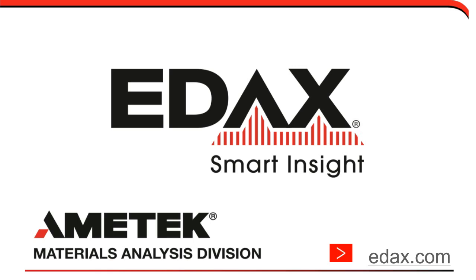Yes, next question is, does the TEAM software work like the EDAX Apex that you're describing? And yes, much of the algorithms behind the scenes is similar. So the end result is going to be similar. Of course, there are different buttons and different tools, and some of the algorithms are refined for data handling during collection. But yes, the end result of the TEAM software output is going to be very similar, if not identical, to the Apex software.